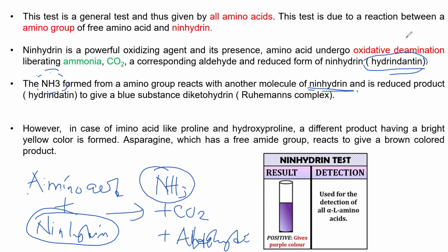Once it reacts, it produces a blue substance or a blue complex known as Ruhemann's complex.